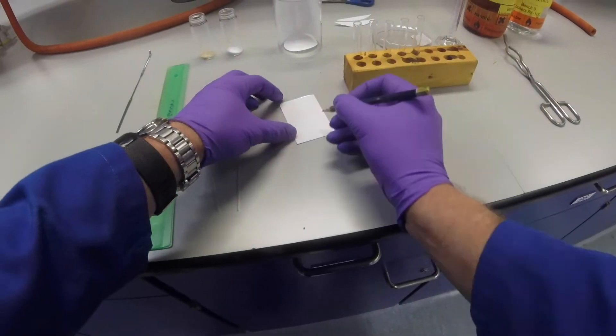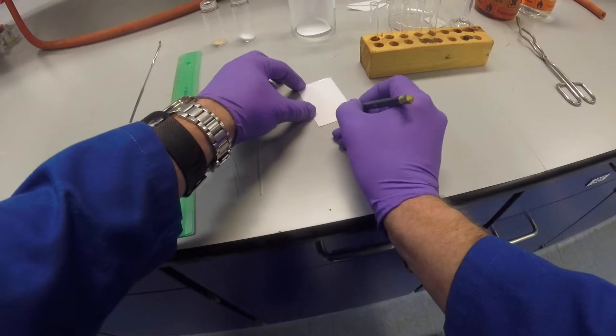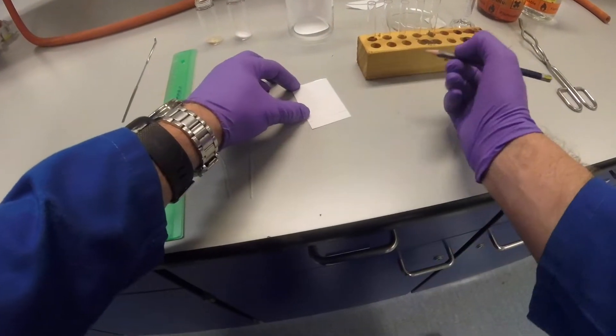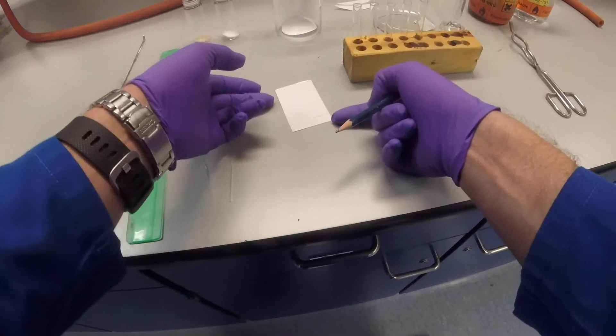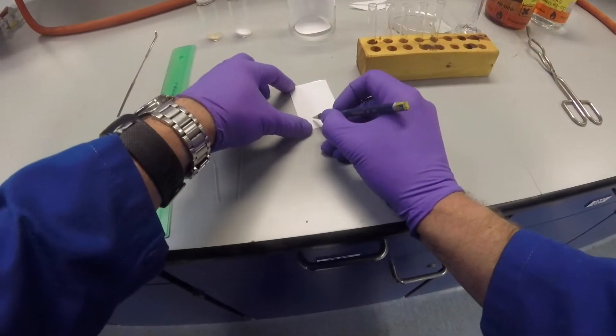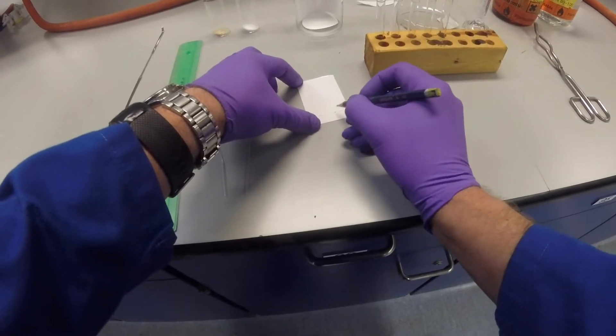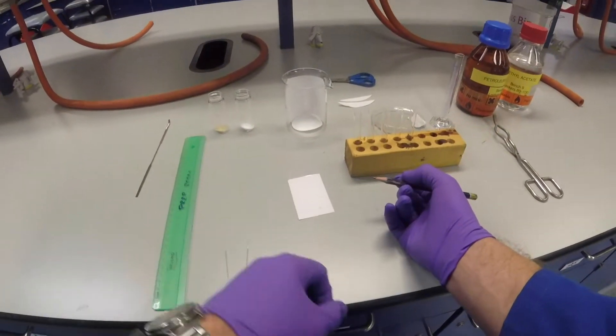The first thing we need to do on our plate is draw ourselves a nice straight line about a centimeter from the bottom, check that the plate is intact and hasn't got lots of silica coming off the sides, and then put a little pencil mark where we're going to do the spots.